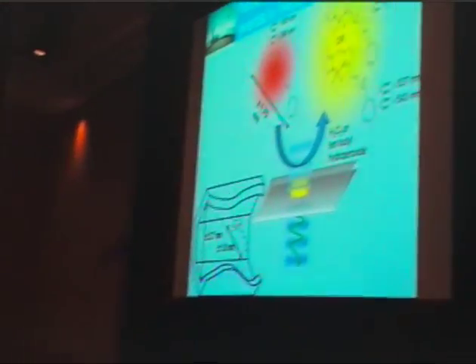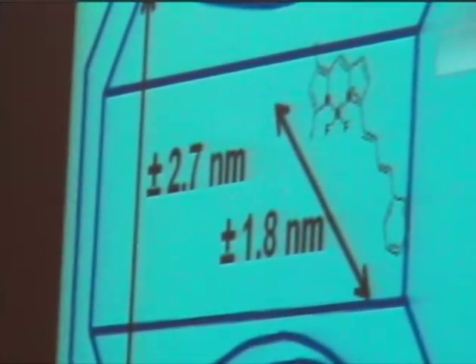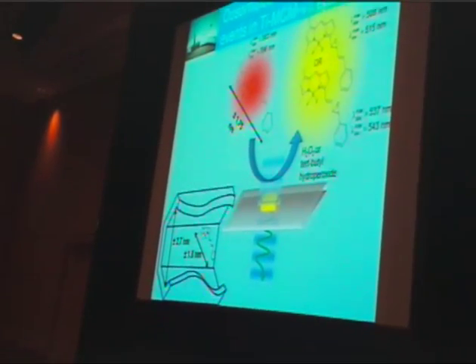Now the size of this probe is between 1.7 and 1.8 nanometers along the long axis. This is similar to, for instance, cholesterol, which is a more commonly used substrate for this catalysis, meaning that it's a kind of representative substrate. It also means that it can really enter the pores. It's still much smaller than the pores of the titanium MCM41 material.